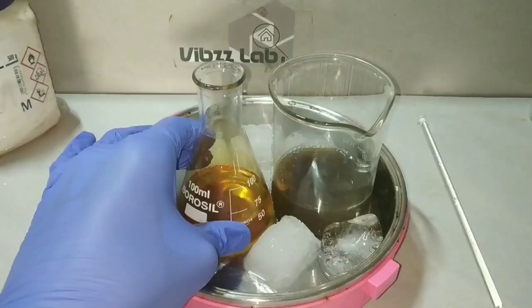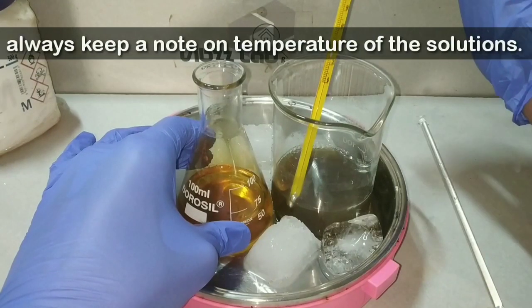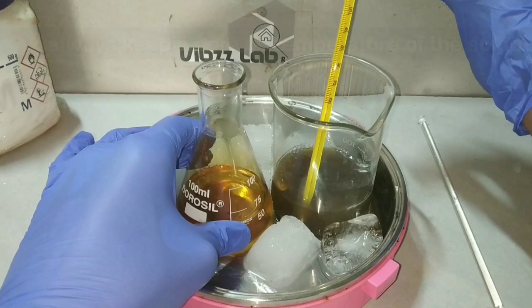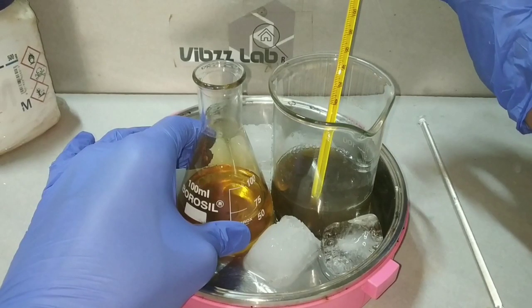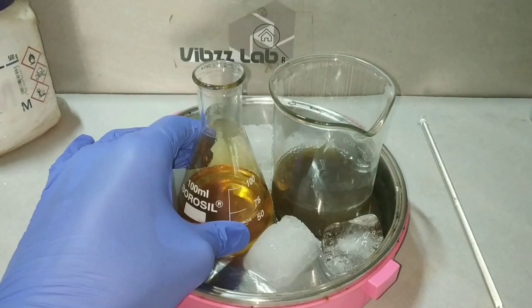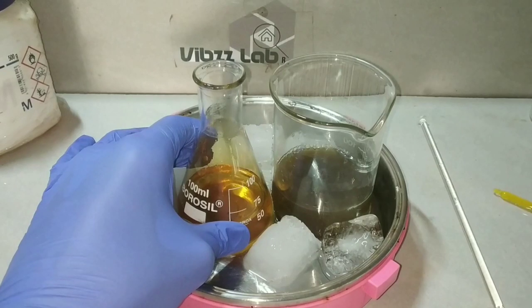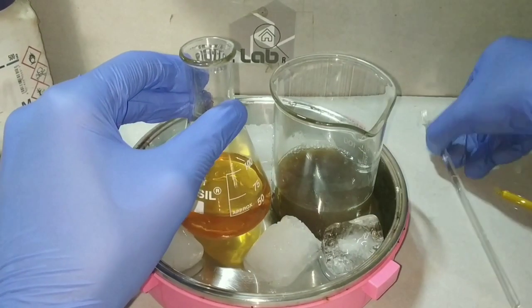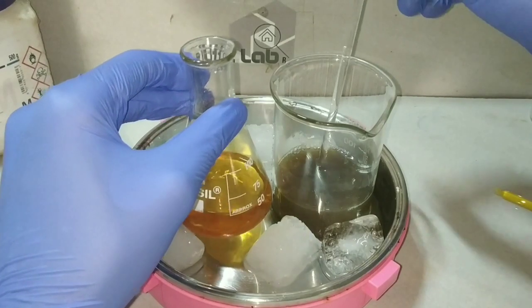After complete addition of the sodium nitrite, the solution has turned to an orange color. We keep it again in the ice bath for cooling, and we note the temperature of both the beta naphthol in sodium hydroxide and the benzene diazonium chloride. When the temperature has reached 0 to 5 degrees Celsius, we add the benzene diazonium chloride solution into the beta naphthol solution with constant stirring.